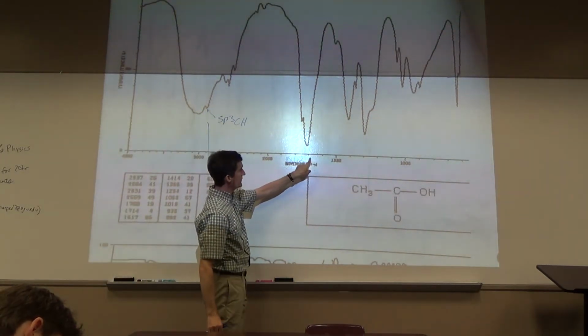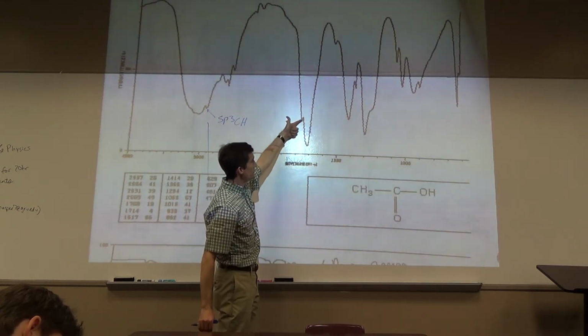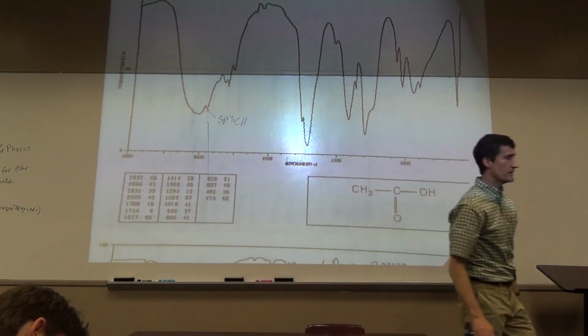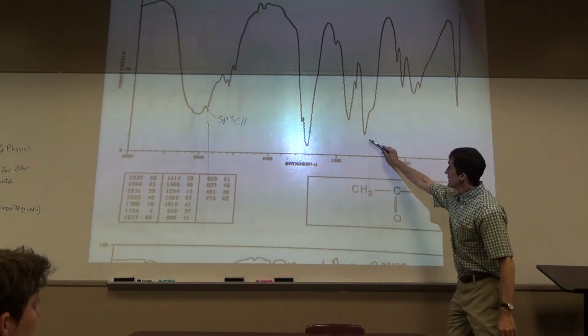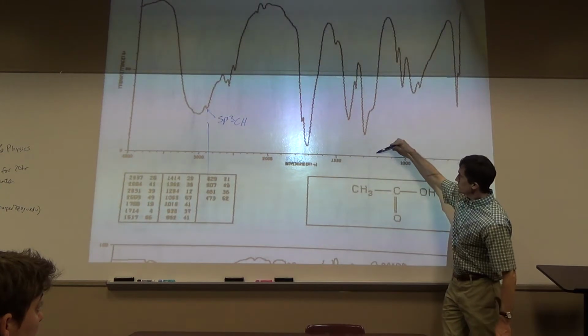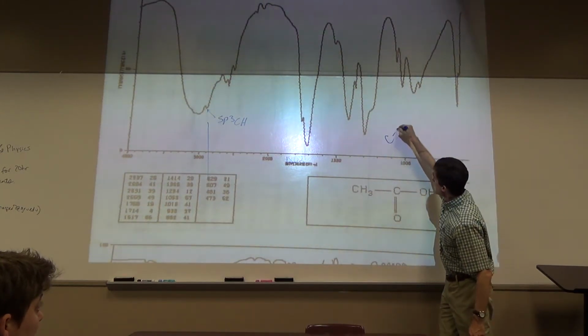Carbonyl is pretty standard, 1710 or so. Not sure why it has a little ridge. Wouldn't worry about that ridge. Would either of those be a CO bond? You could possibly say that's the CO. Usually it's about 1100 to 1200. That's more like closer to 1300, that could possibly be.